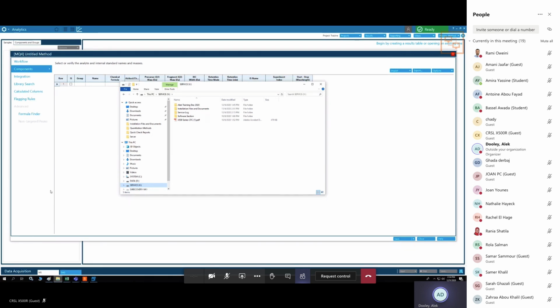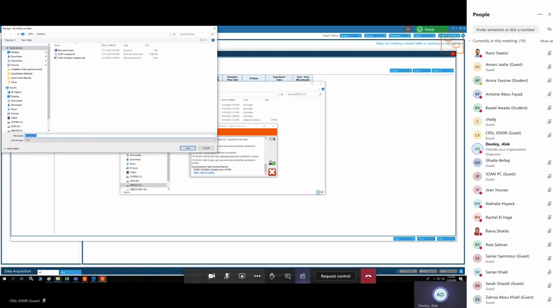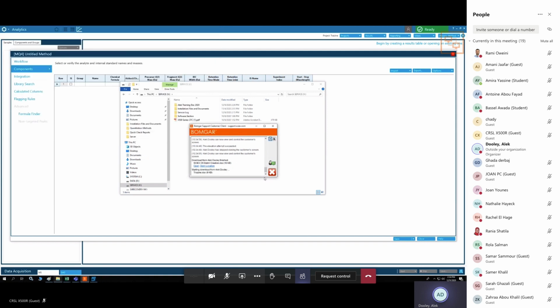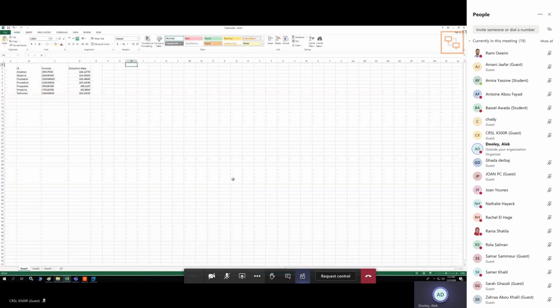Right, so I'll send it to you. Send the file. And I'll put that also in the V drive in my folder, triazine save. All right, now it should be here. Yes. Now it's going to be the wrong file.